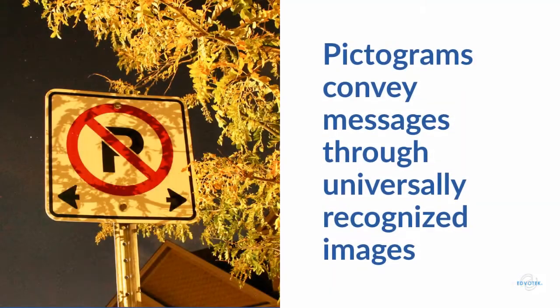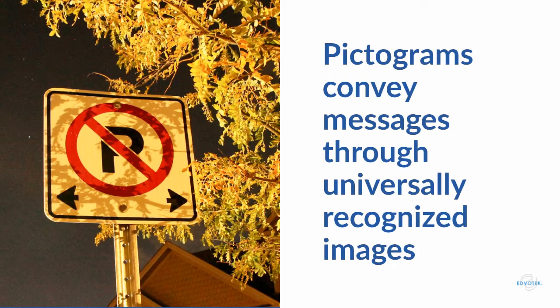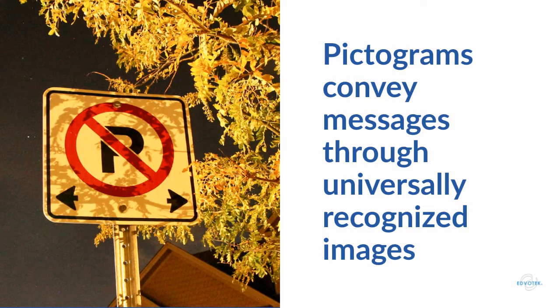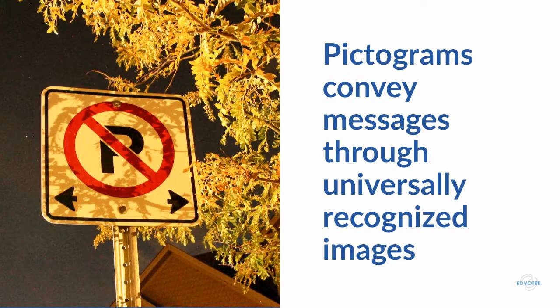One key component of the GHS is pictograms, which are graphics that convey a message through symbols. These universal images eliminate language barriers and make for fast, efficient communication. For example, when we see a red circle with a line through it, we know that means NO.